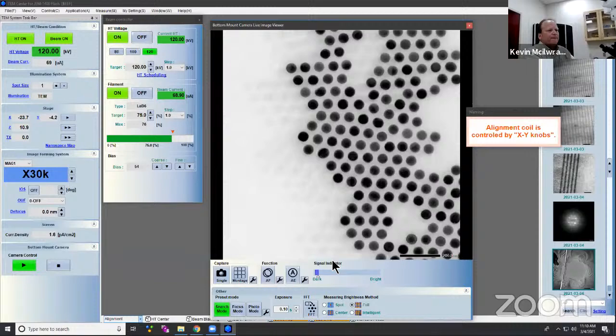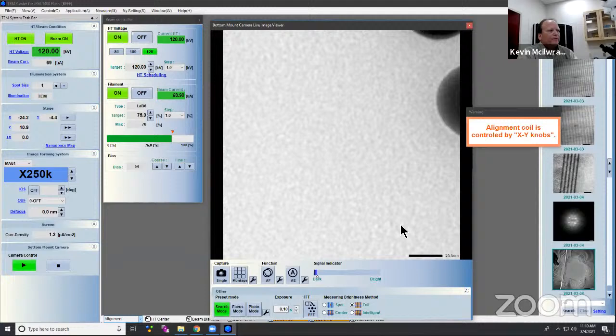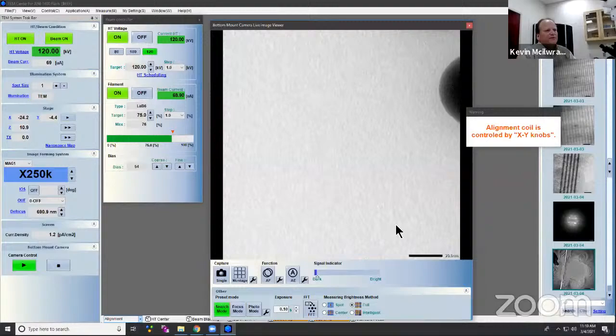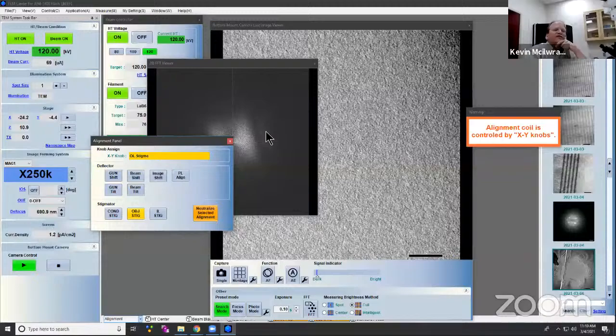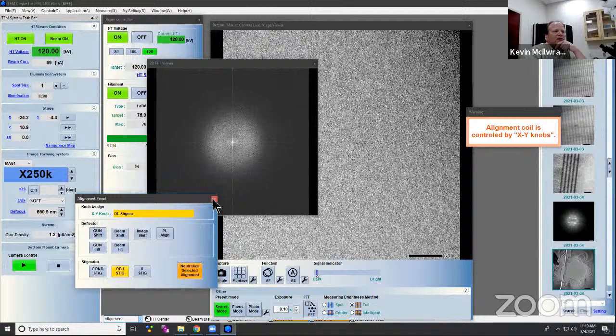One thing I'm going to do is I set this high mag stigmation setting, so this might be off a little bit, and I think it is a lot actually. So I'm going to go back, and I know my default for this is good. We can see this is a misaligned, bad stigmation. I'm going to neutralize that, and it just goes back to what it should be.